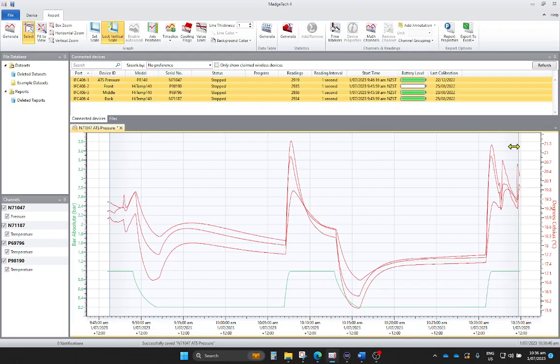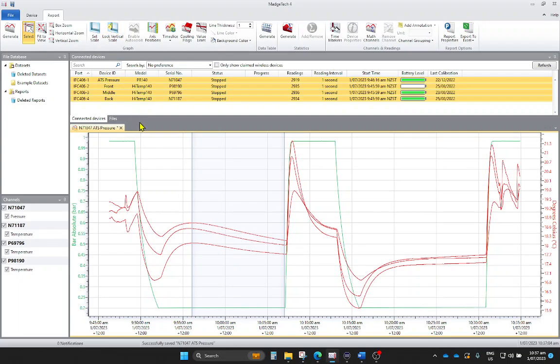And now we've got the little arrows. I'm just going to roughly drag it to where we want. Come over here, again, roughly drag it to where we want. Okay, so we know that the vacuum test is 10 minutes. I'm going to turn the lock scale off for a second, and we know that it finished the vacuum test the minute the vent solenoid opened.